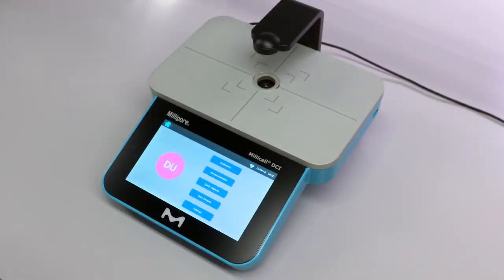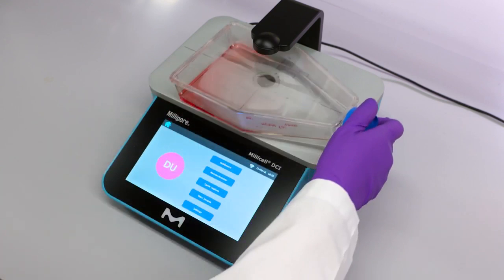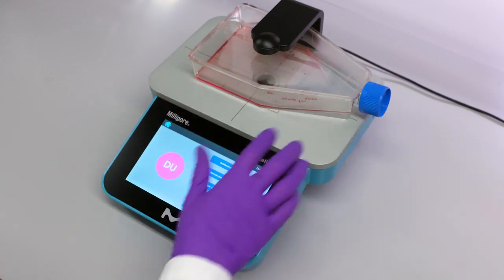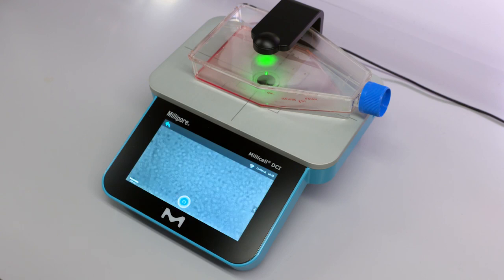Millicell DCI image settings are available in all three imaging modes: confluency, hemocytometer, and quick capture. Place the flask on the stage and the image will automatically be displayed.